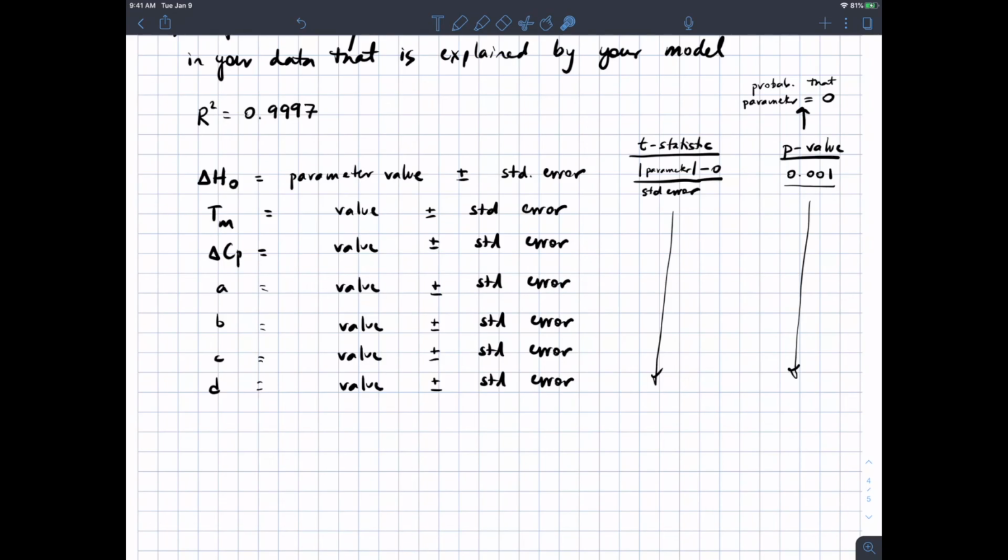Similarly, baseline intercepts A and C are almost always statistically significant. That is, for us, statistical significance, i.e. rejection of the null hypothesis, is when p is less than or equal to 0.001.